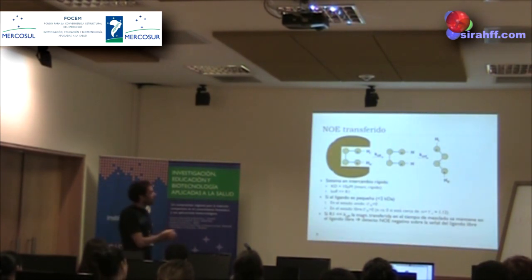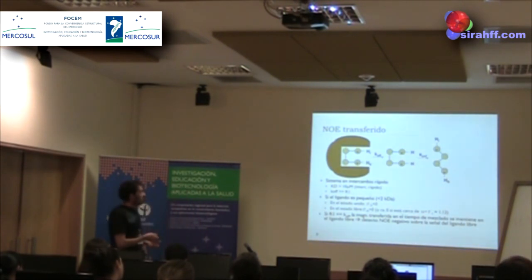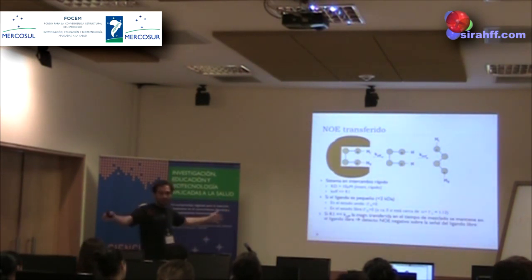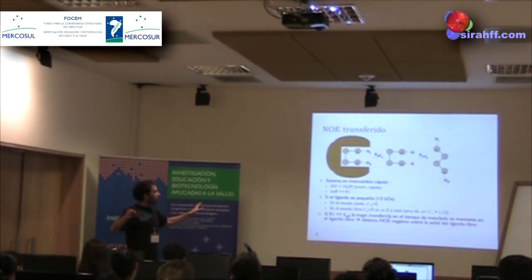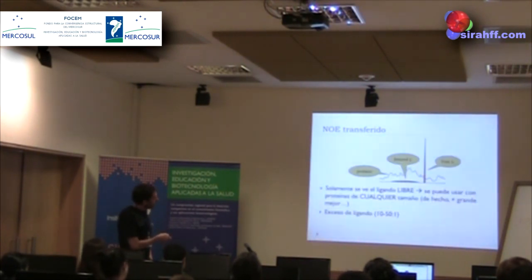And why is this important? As we were talking before, we have a slight limitation with our big molecules, because the lines are just too broad. But you can work with any big protein here. You don't need to see the protein, you don't need to see the ligand-protein complex, but you can see the information transfer that happens here.